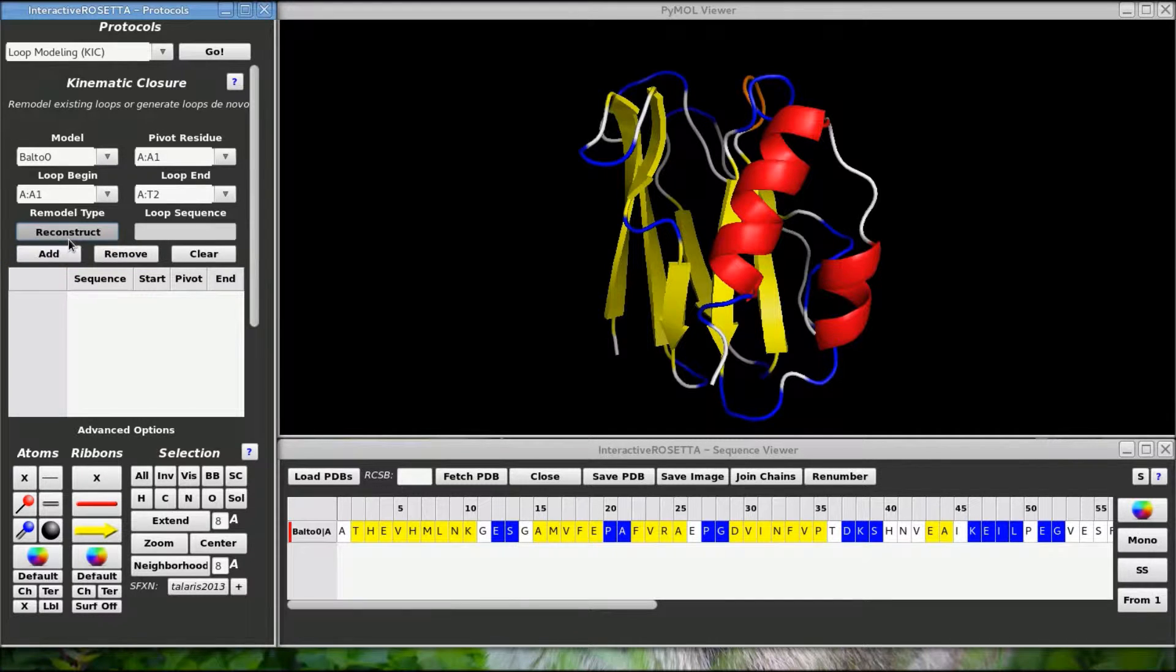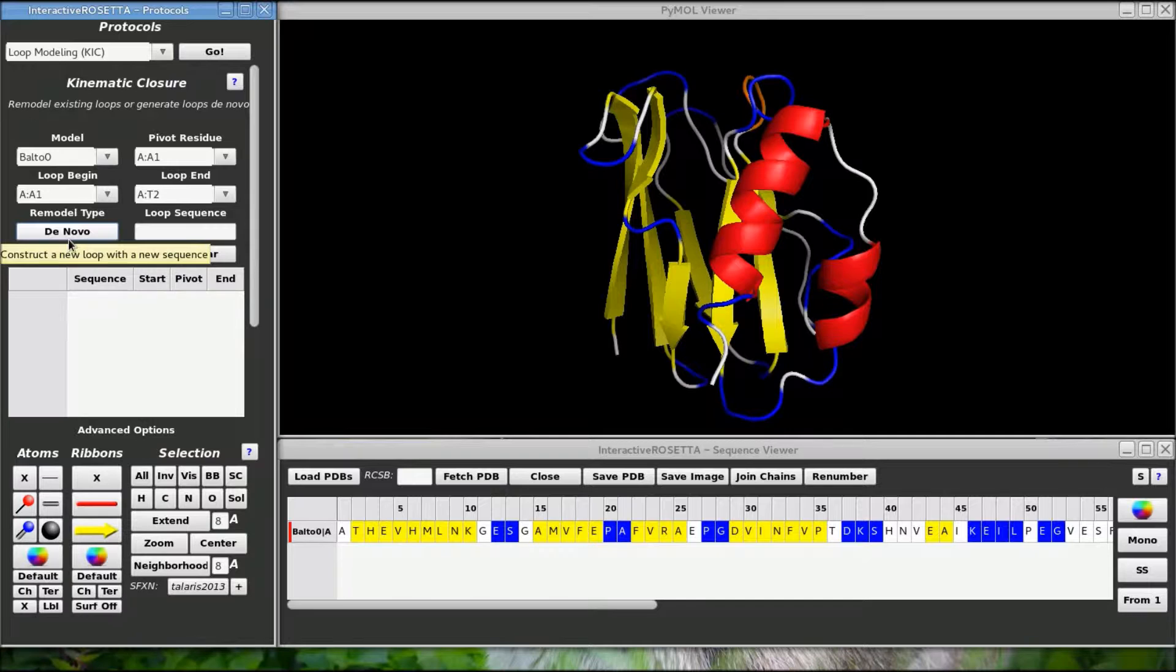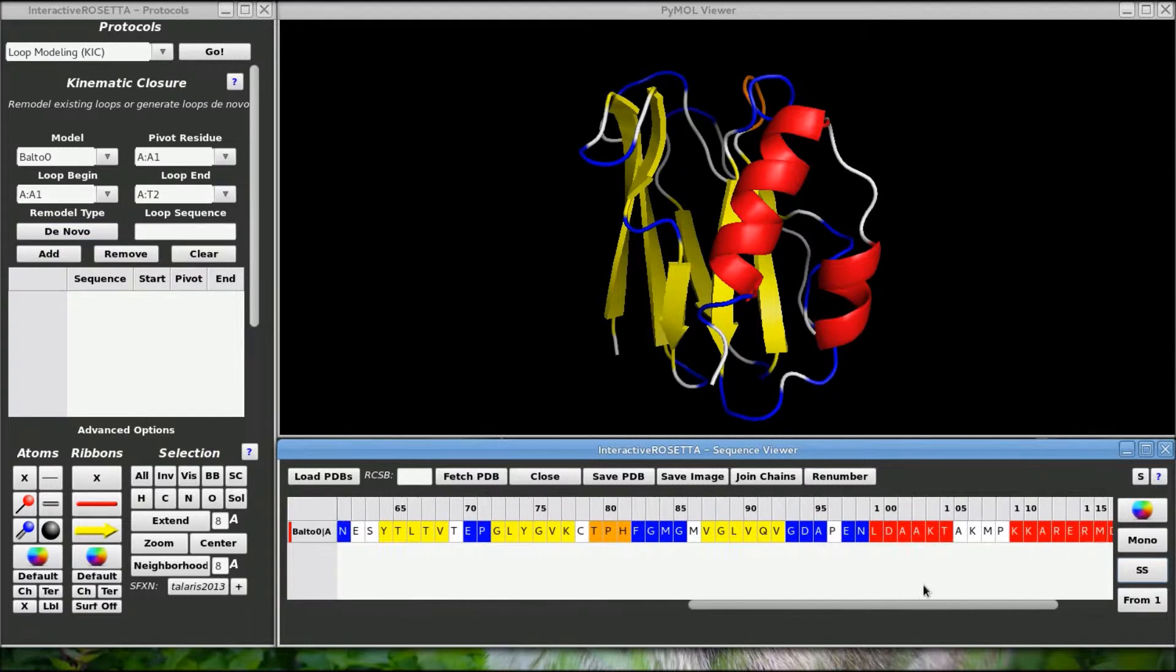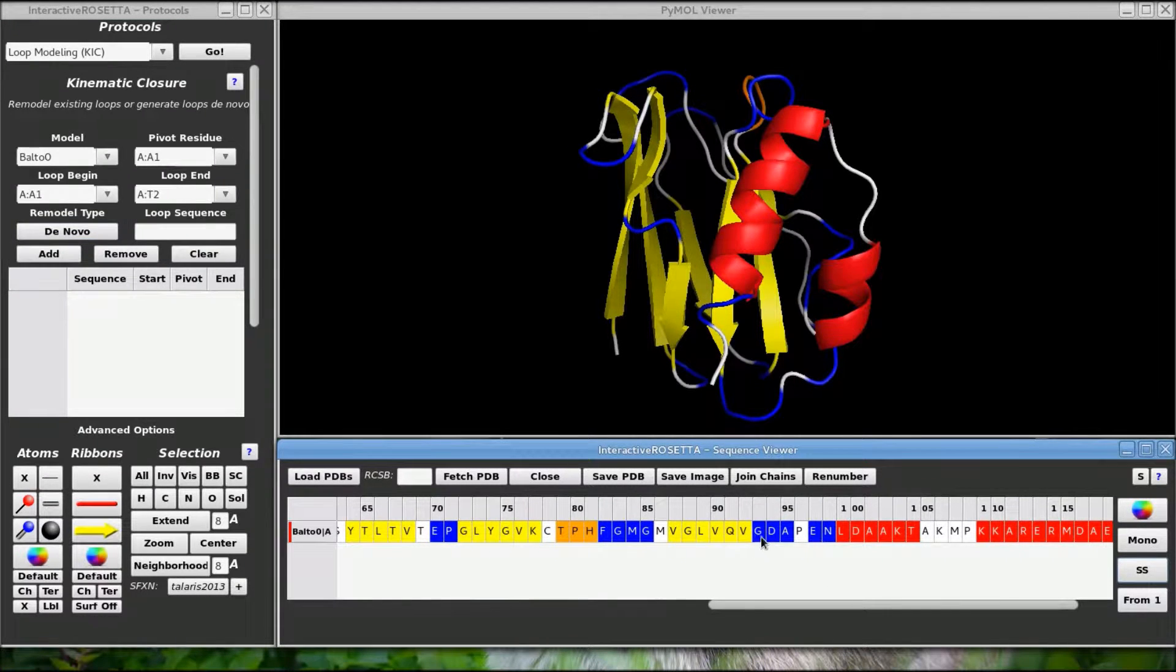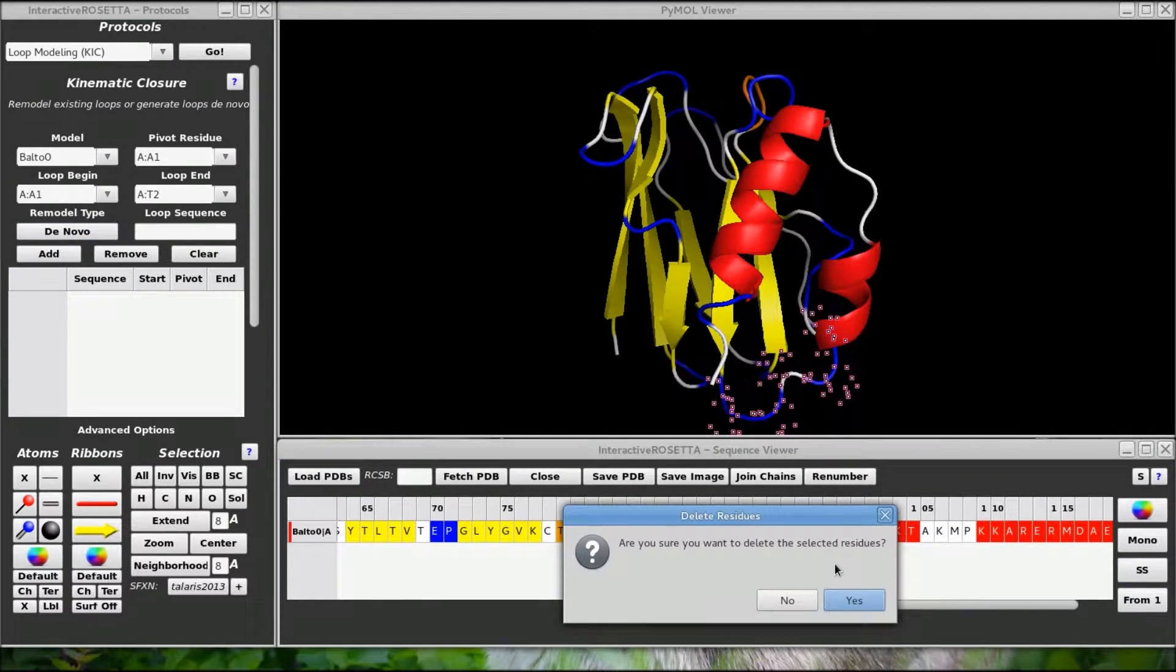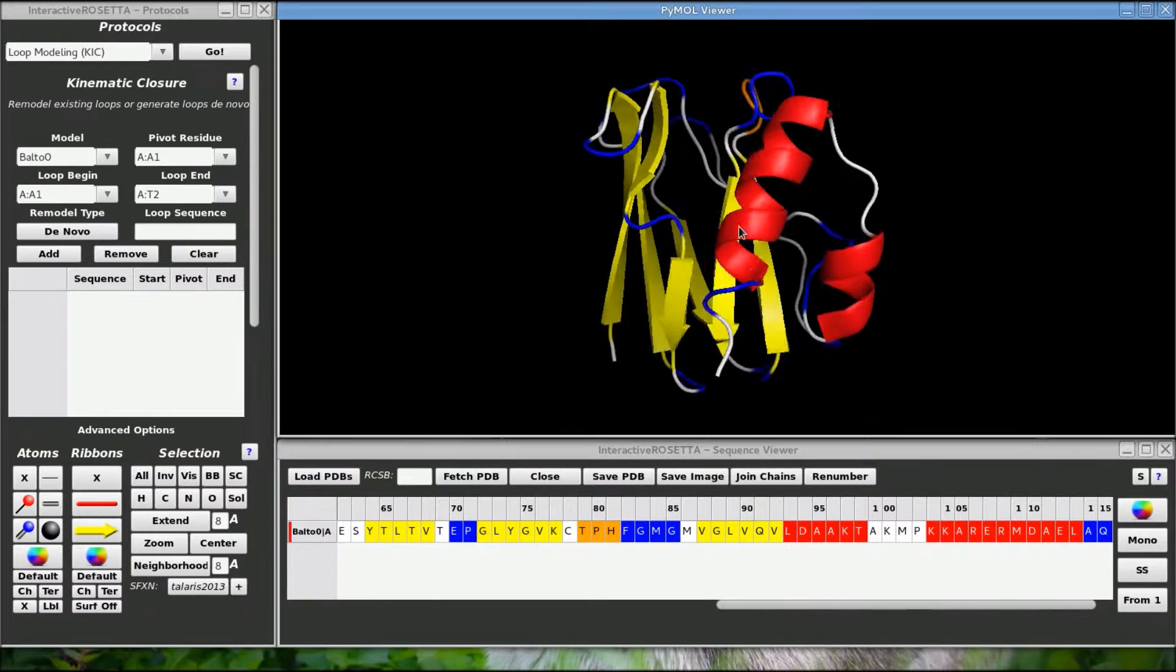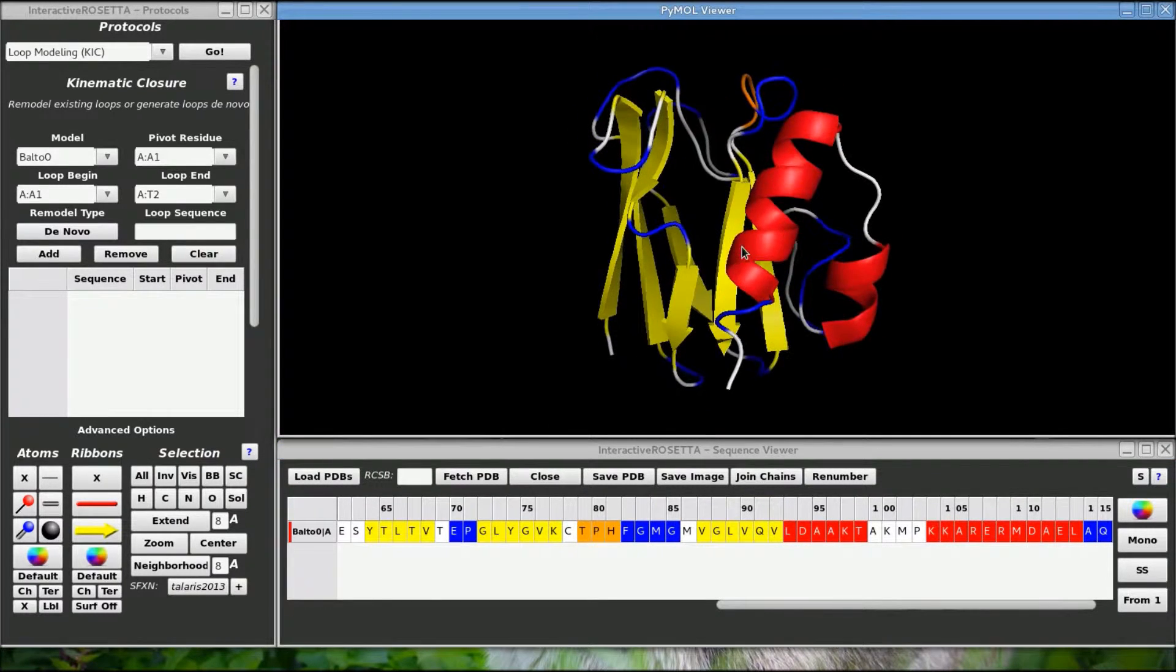DeNovo mode allows you to create a new loop in place of an existing loop with a new sequence. I am going to go out here in the sequence and delete this loop out here. You can delete residues by selecting them and using the delete key. Now we will try to get the loop back using KICK.